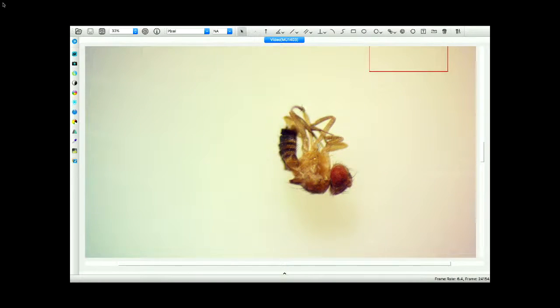All right, so we're seeing it still has a tan body. It still has round red eyes, but there's something very different about this fruit fly than the wild types. What are you noticing is different about this one? You're probably noticing it doesn't have any wings. We actually call this apterous. Okay, so this one has no wings. So if you're following along on your worksheet, feel free to include this in the wing mutation section. It's called apterous, or if you want to put in your own words, no wings.